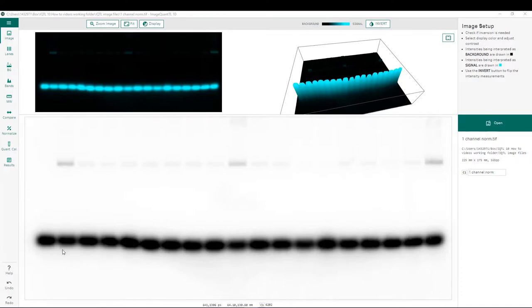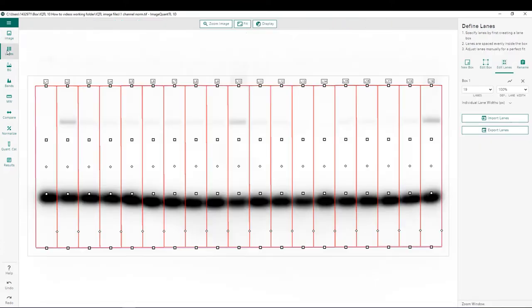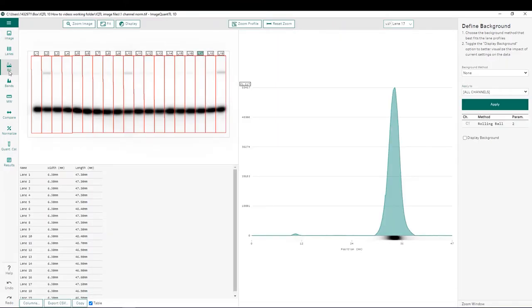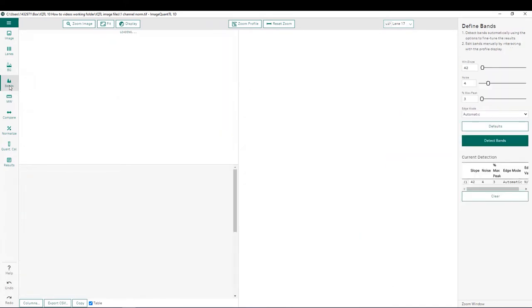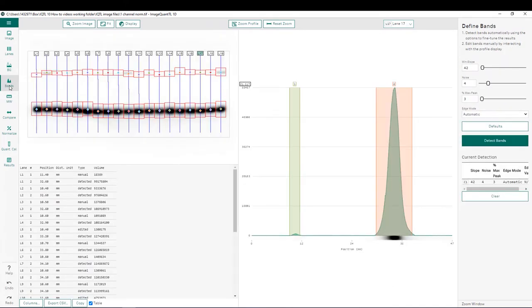Prior to normalization, we must complete the following steps: lane creation, background subtraction, and band detection. Once these are completed, we can now go to the normalization step.